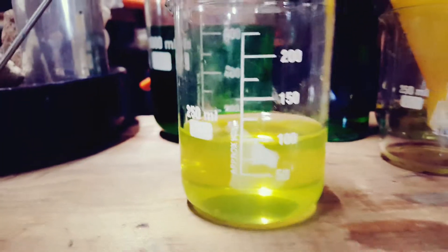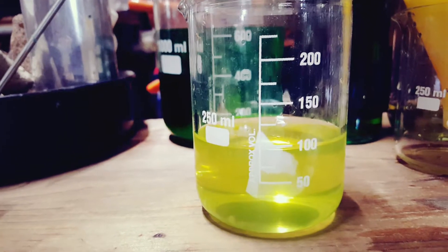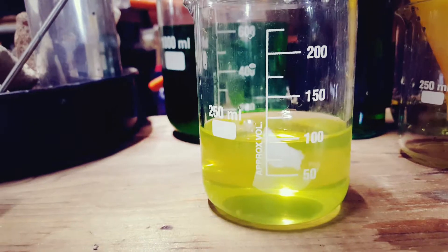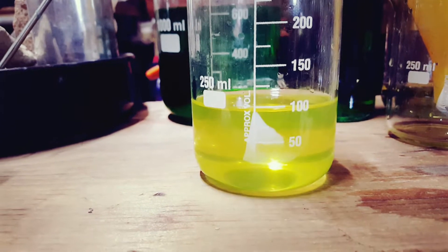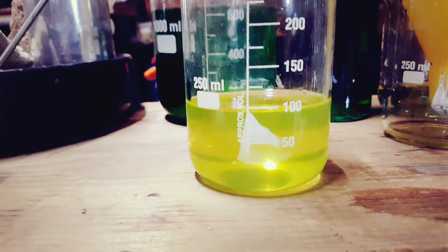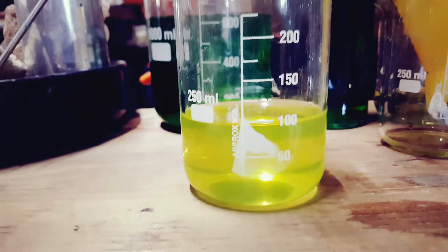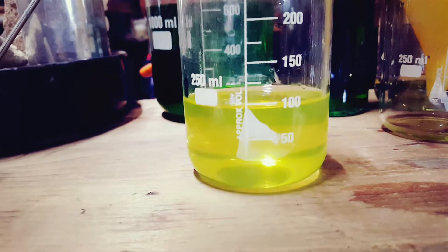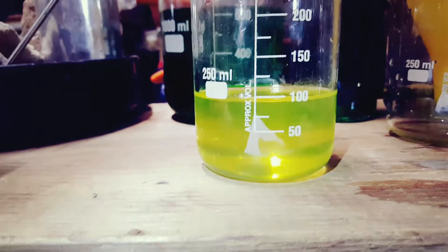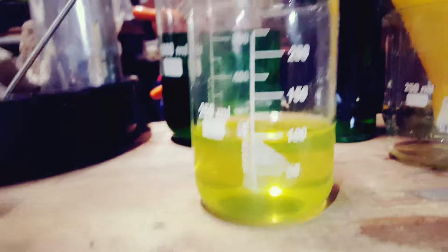Now I'm going to add some copperas, or ferrous sulfate, to precipitate out the gold. The only reason it might not work is if it gets reconsumed — re-leached back into solution — which would mean I still have too much nitric acid in there. Let's see what happens.